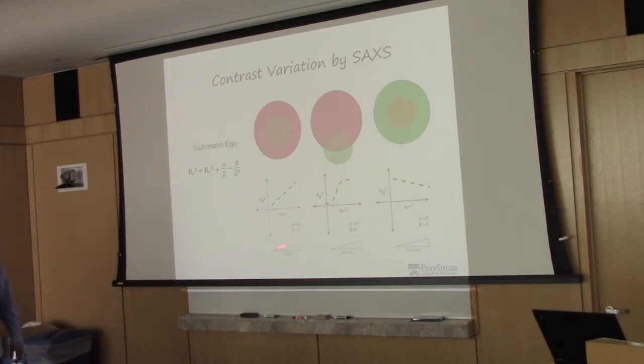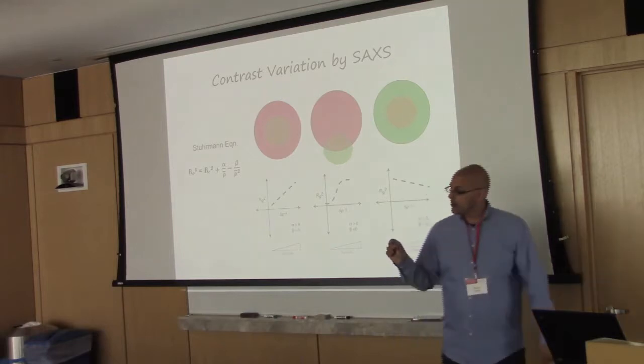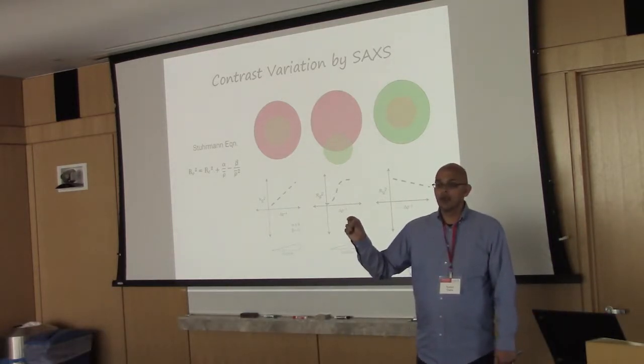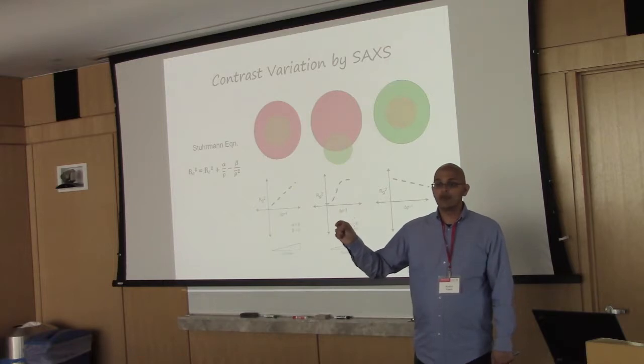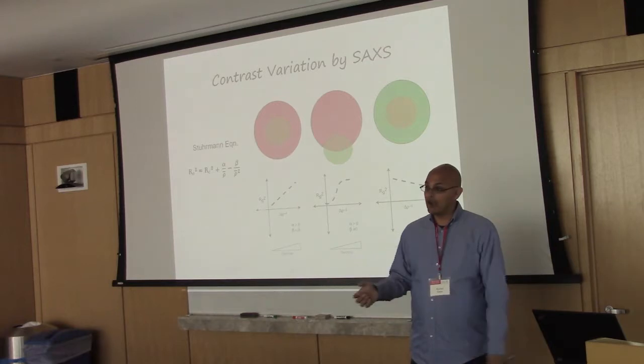You can simulate this data, and then with increasing amounts of sucrose, you can make predictions of what these Guinier plots in this window would look like using X-rays. All these experiments I'm going to talk about now were done here at MacCHESS, with very small amounts of sample. At the time, they had a customized 15 microliter sample cell, so we could use a minimal amount of material, which was ideal because I only had 10 micrograms of this stuff.